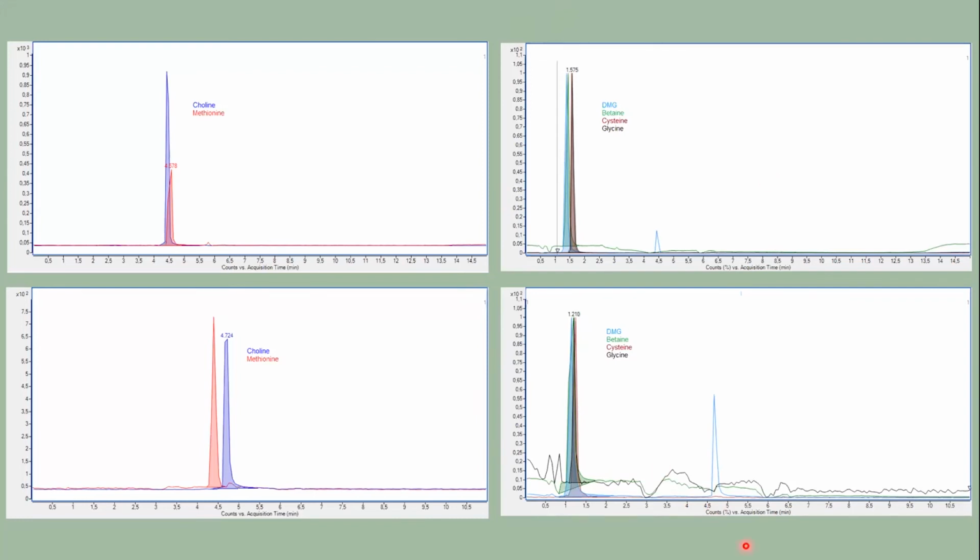And with the adjustment of the gradient, I couldn't obtain better chromatographic separation. This is only profiles of 2 different gradients. I used others as well, but did not find it to be successful.